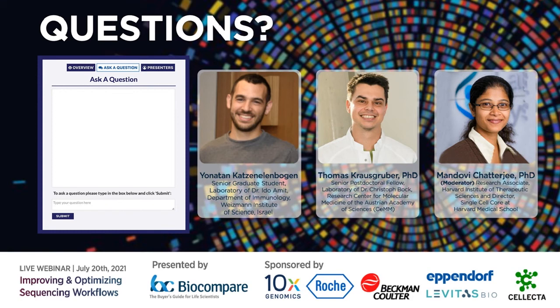It's a great question. We didn't get a chance to cover data analysis today, but it is a big component of any single cell or bulk RNA sequencing experiment, and one needs to set aside adequate resources for that in terms of time and money. So if you're well versed in bioinformatics yourself, there are some open access resources out there, like Thomas mentioned, or you may want to have a bioinformatician to do that for you.